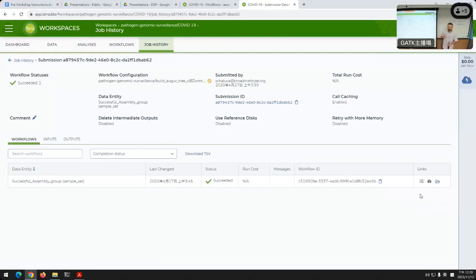It shows you how the parallelization took place in case you're trying to either troubleshoot or optimize your workflows. With that, I'm going to pause briefly to see if there are any questions, and then we're going to go find the workspace that we're going to use for the demonstrations, and we're going to clone it. So, any questions so far?